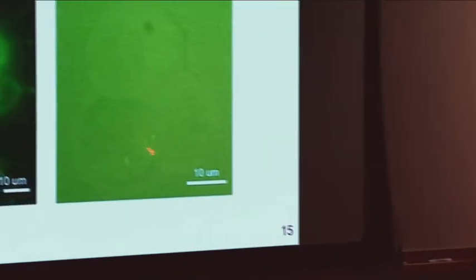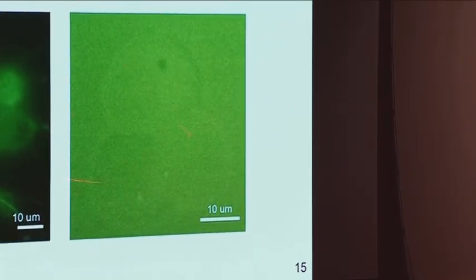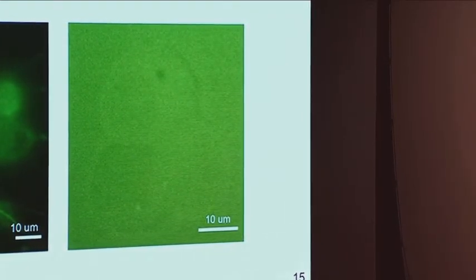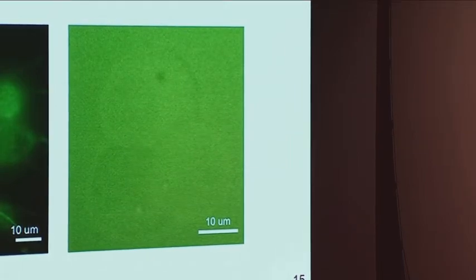What I'm showing you here is barely visible. If you stretch your imagination, you can see that there are actually 2 quantum dots within this cell. And that's pretty much the signal we can get. But what makes things even worse is that these cells die. Apparently there are some apoptosis factors being triggered. So we did some debugging, and then we worked with Jessica's lab, who provided us with a new batch of quantum dots that are coated with micelles, which is the one that Gan talked about.